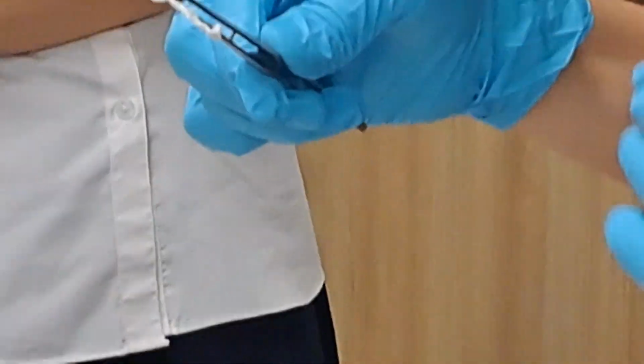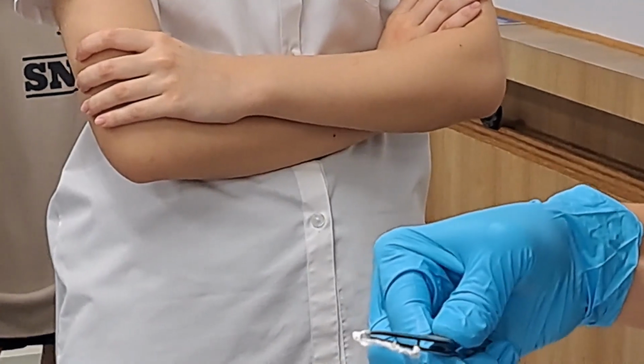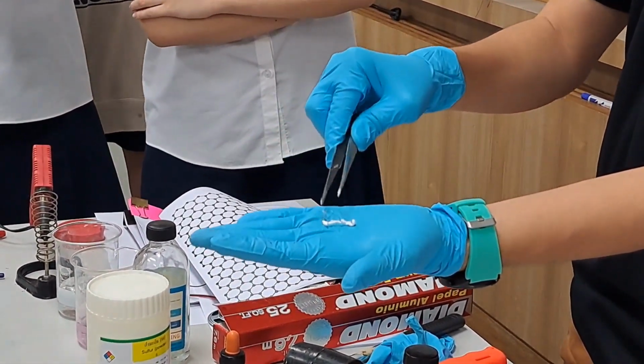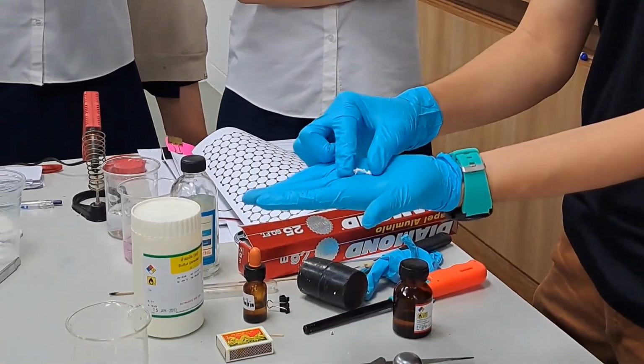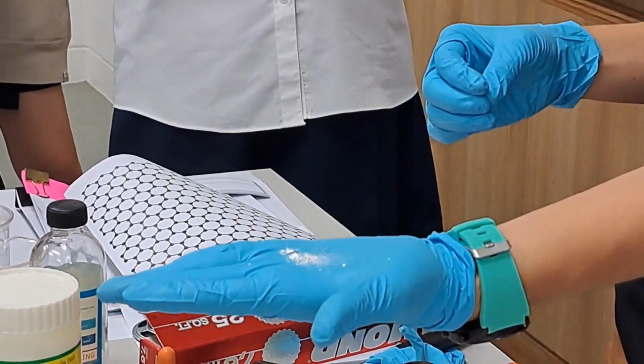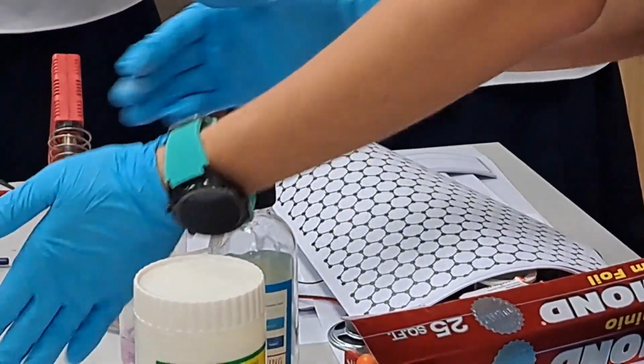Is it not that stiff? It crumbles. So I want to take a video. Do it now. 1, 2, 3. All right, this is very crumbly, like it's already burned. Okay. All right, one more time, right? Yes.